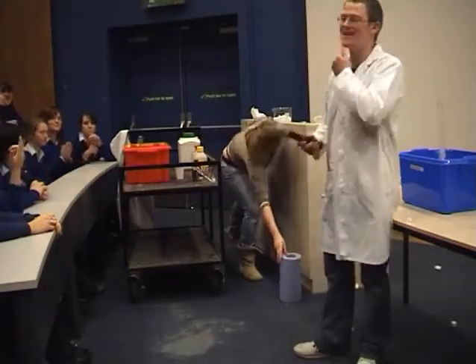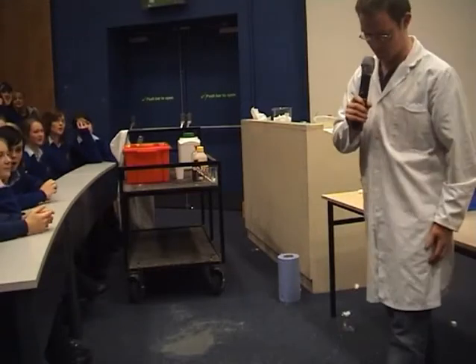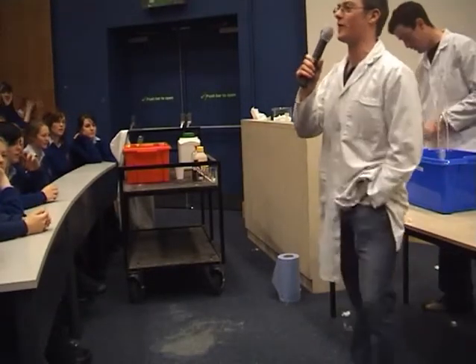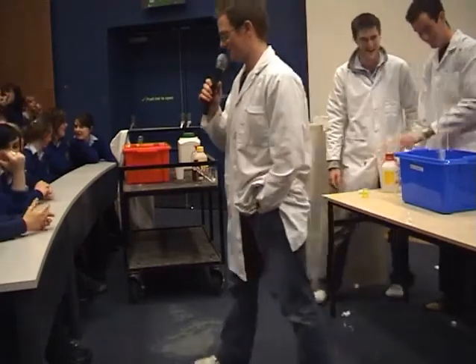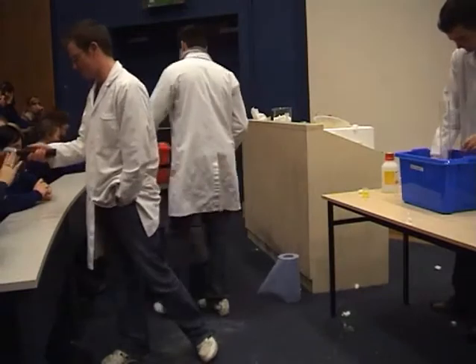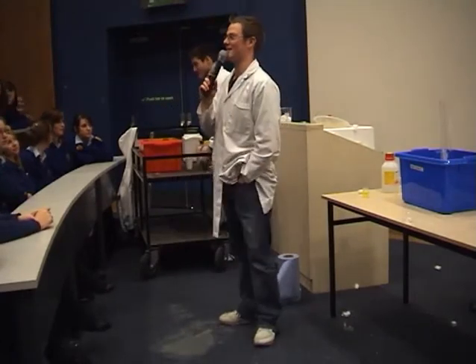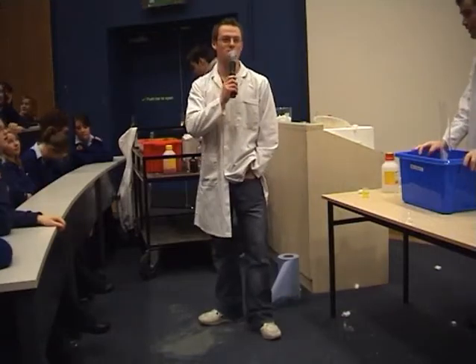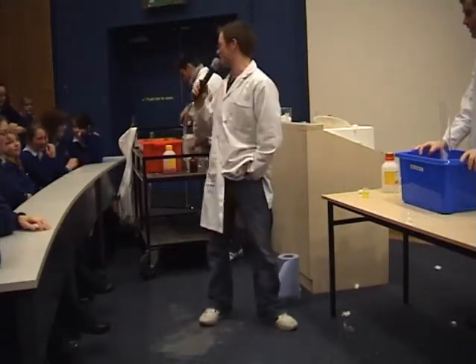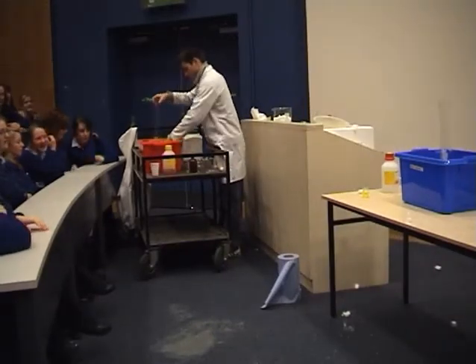Right, okay, there are two main components in air, and I'm going to tell you what they are: oxygen and nitrogen gas. First of all, we're going to release some oxygen, so I'll pass on to Richard. Thank you, Cole.